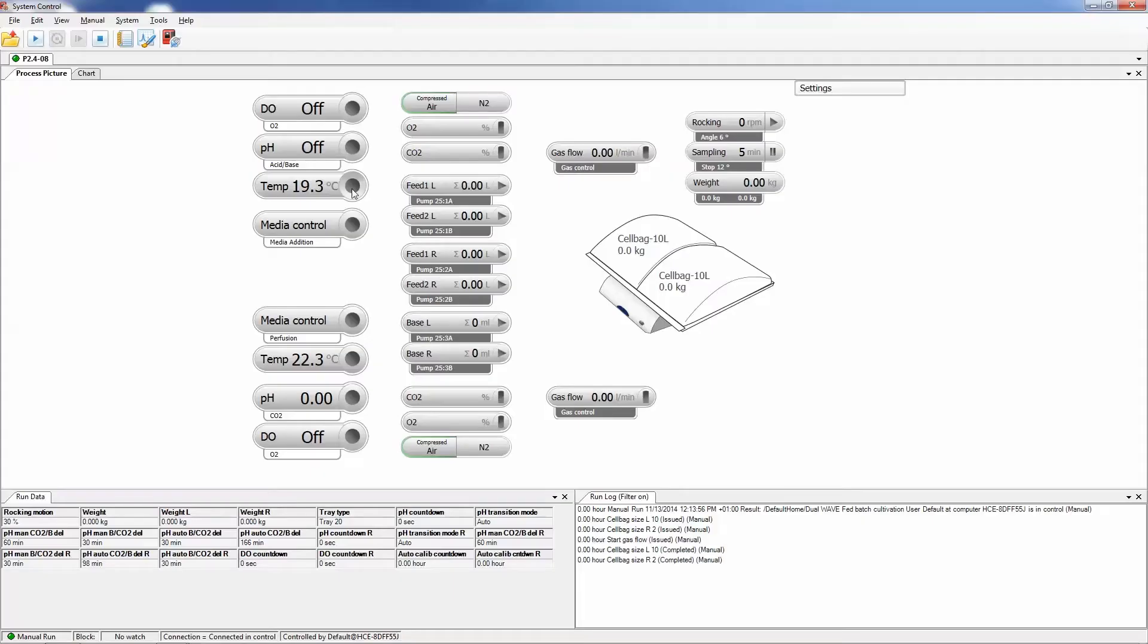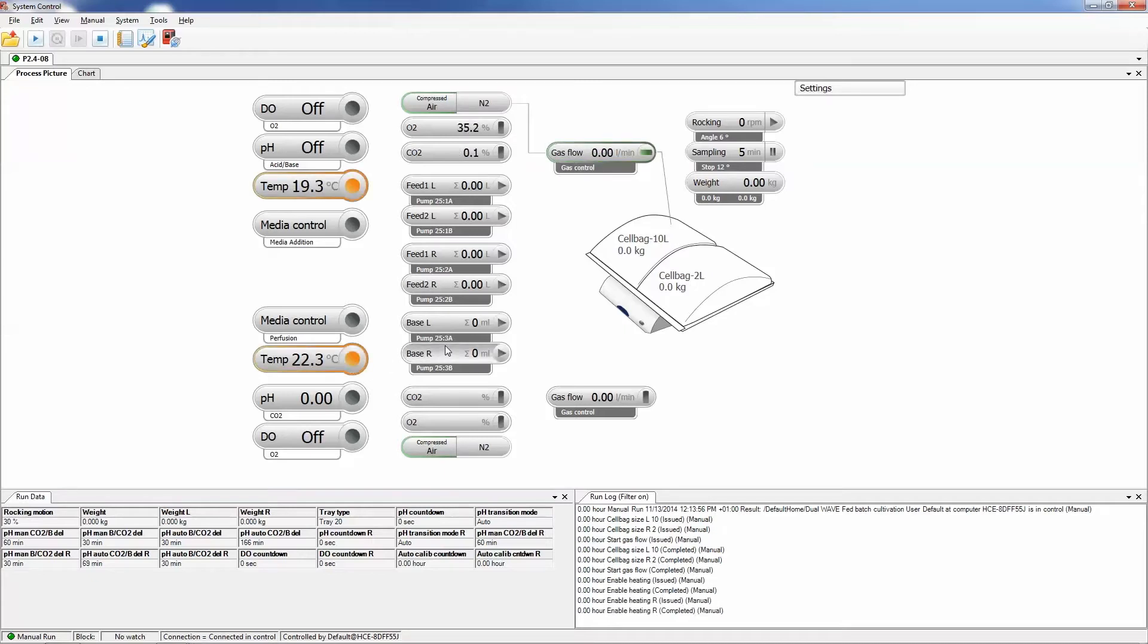Parameters such as temperature, pH, DO, and pump speed are controlled independently.